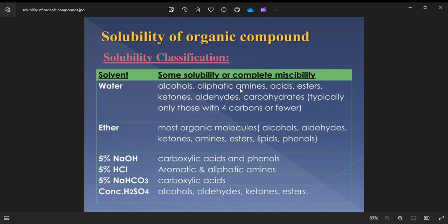They dissolve in water, but they did not dissolve in sodium hydroxide, neither do they dissolve in HCl. That tells you that these are low molecular weight compounds. It could be ketone, aldehyde, or esters and co. You can't specify which one, but the group. So when your substance can only dissolve in water and refuses to dissolve in other substances, then this is either ketone, aldehyde, esters, and so on.